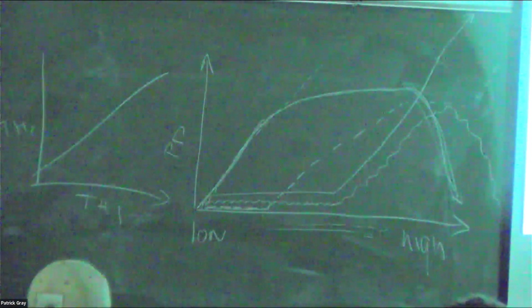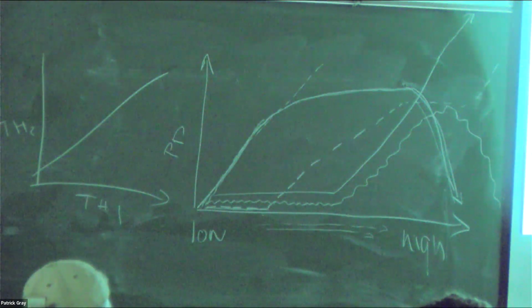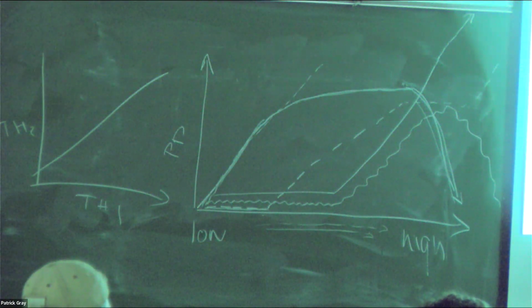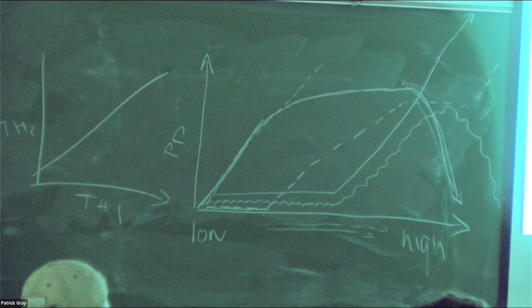You're going to try to do a calibration curve. We usually do a calibration curve with tons of different things, but you guys have to sleep and want to finish up and have drinks and stuff. So you're going to do just 3 different dilutions, actually 2 different dilutions. You're going to have a full sample, 2 dilutions, and filtered seawater. You're going to extract chlorophyll in vitro, so extract it with acetone, measure, and then you're going to collect in parallel ecopuck, eco VSF measurements of chlorophyll and try to make the calibration curve.